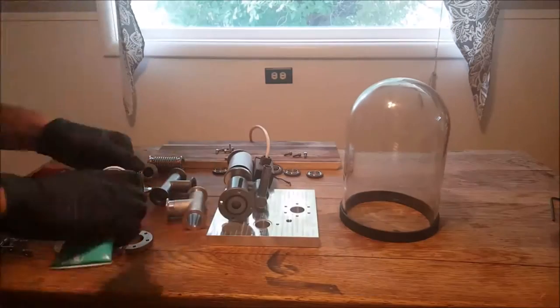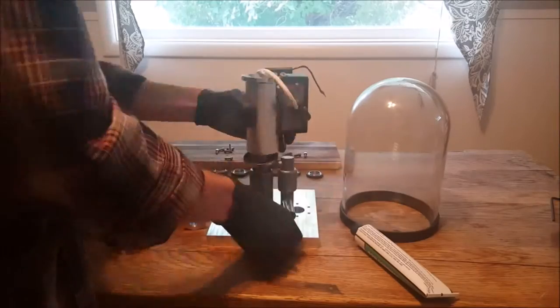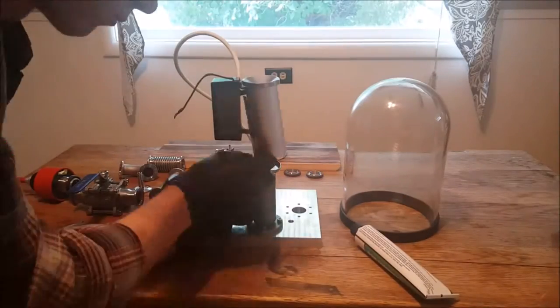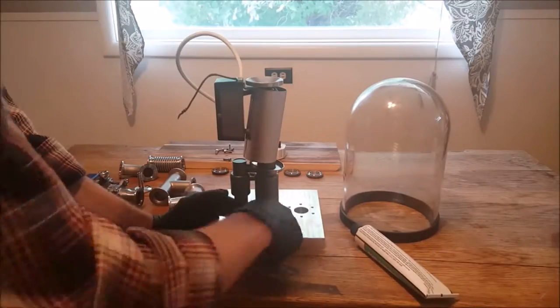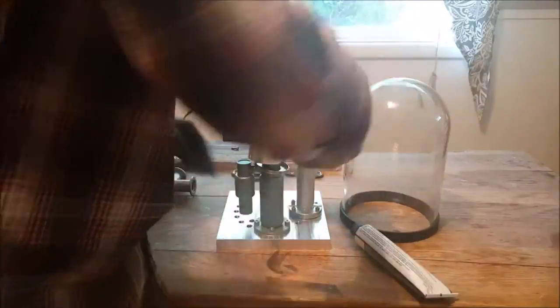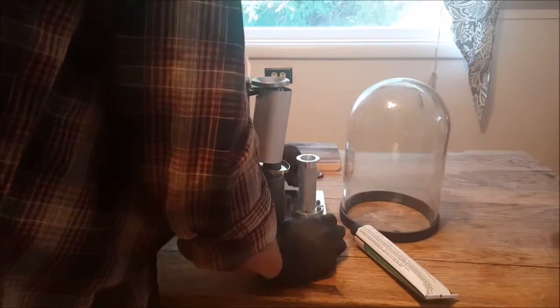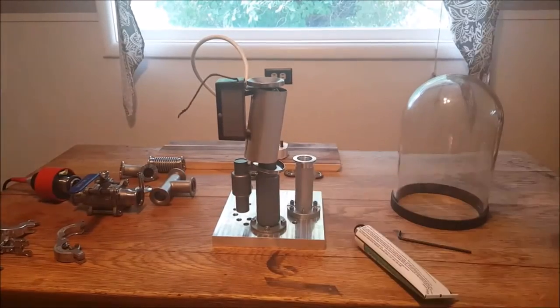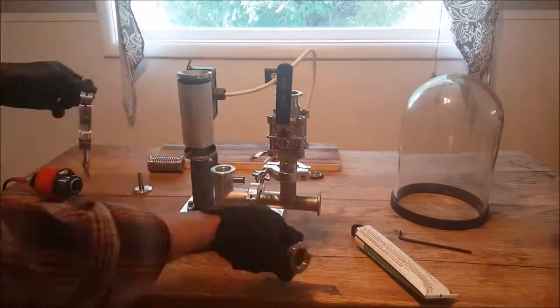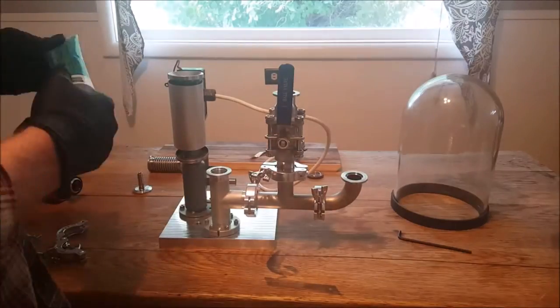This is one of those moments where I'm particularly thankful for magical video editing. As you can see, I'm putting on the diffusion pump. Next I'll be putting on the vacuum fittings, which are also the electrical fittings. The KF-25 fittings are pretty simple to put together.